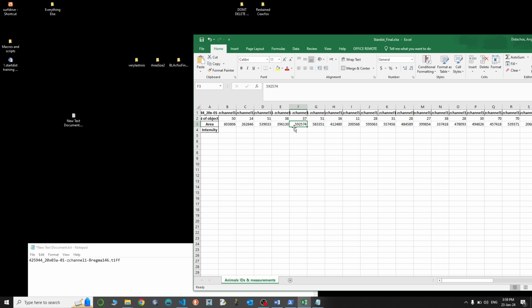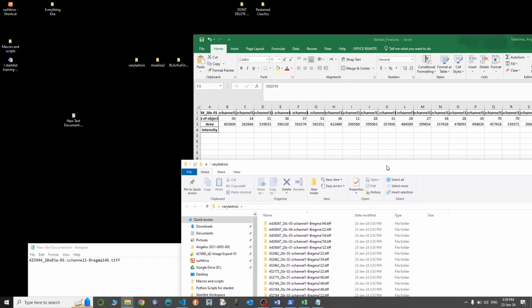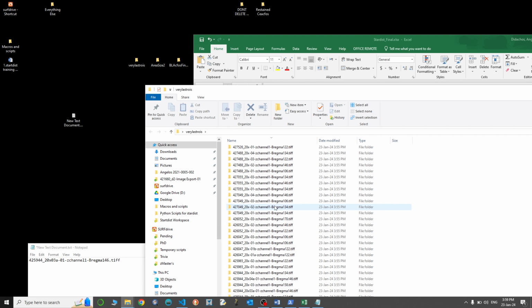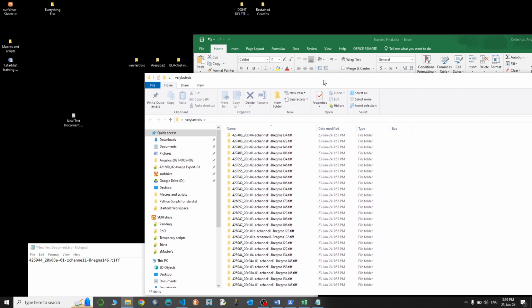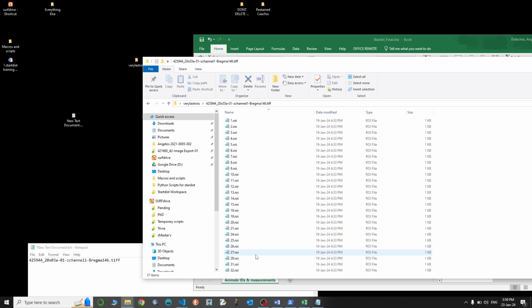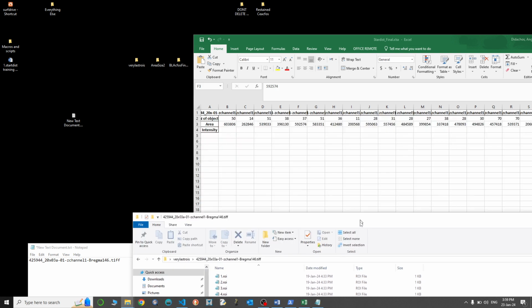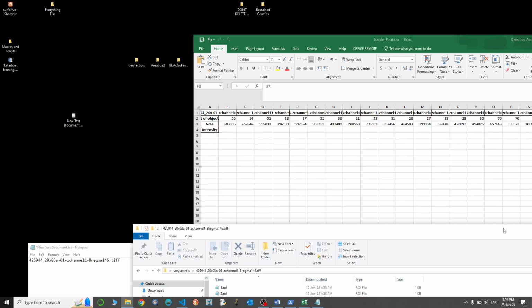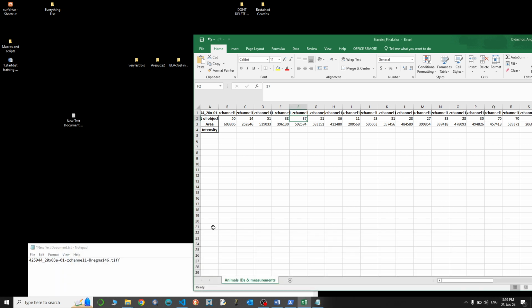Okay, let's start with the first one. Let's see at the very last row, if I go to 42, 59, 44. All right, let's see where we have it. All right, and this is 20x03a. Should be this one. So 37, it says 37 it is. So that's fine. And some validations for the area.